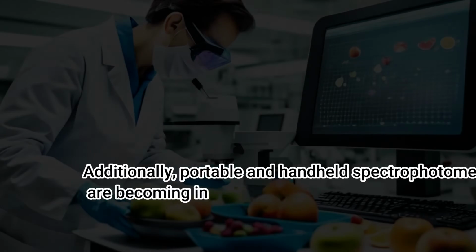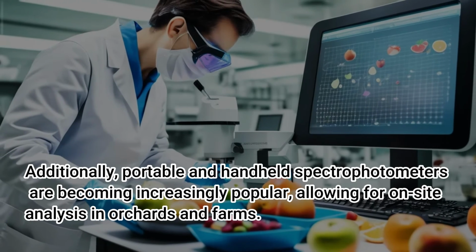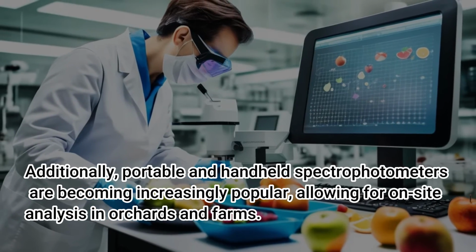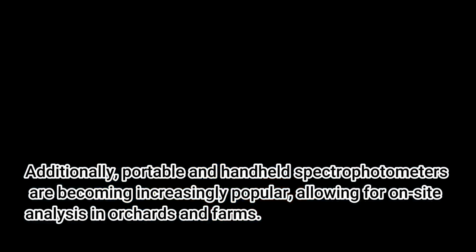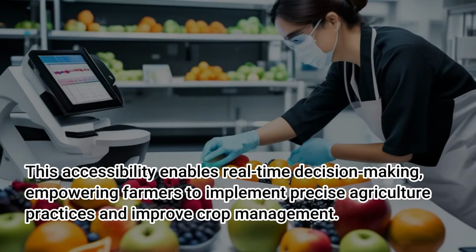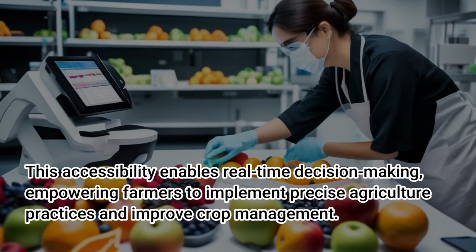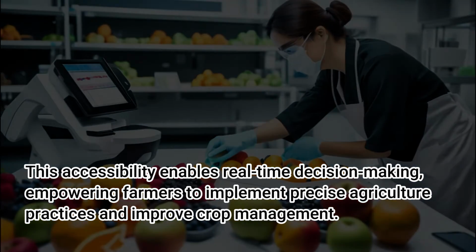assessment. Additionally, portable and handheld spectrophotometers are becoming increasingly popular, allowing for on-site analysis in orchards and farms. This accessibility enables real-time decision-making, empowering farmers to implement precise agriculture practices and improve crop management.